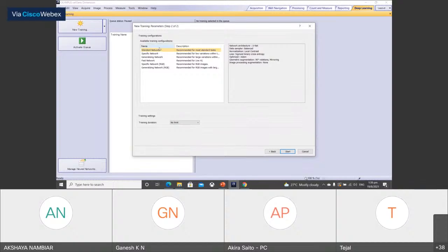And there are a couple of types of neural network, with different features. Like these two are for the color image, and this one is for a little bit smaller neural network creation, which can give the result much faster.